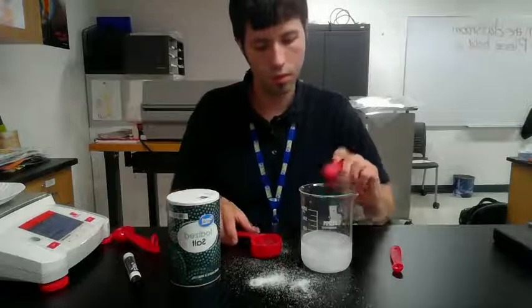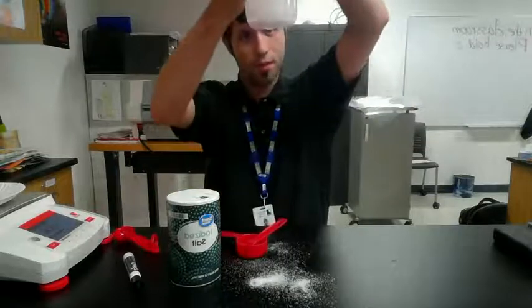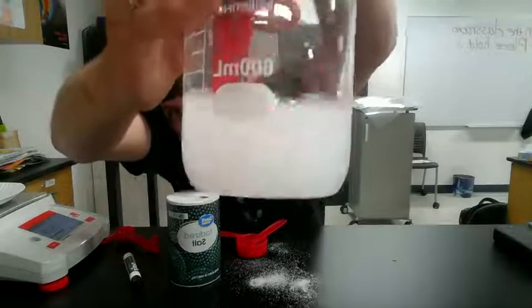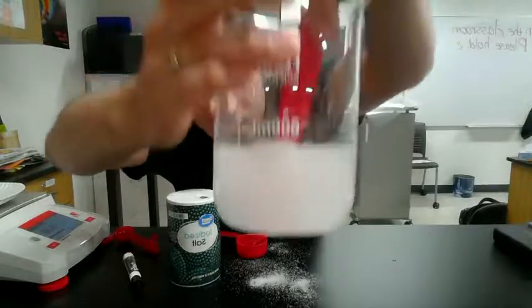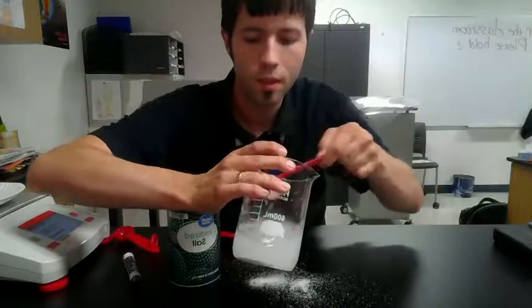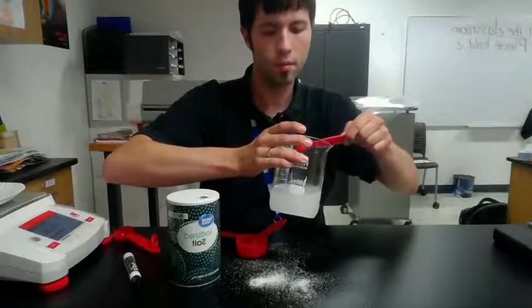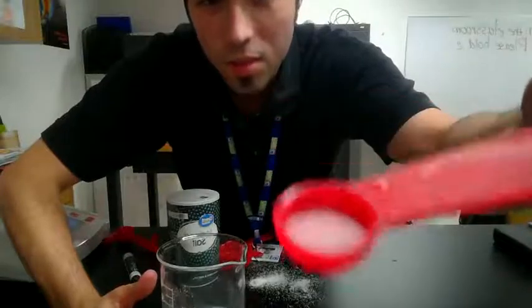3. Okay, so now I should have the maximum amount of salt dissolved in here. And actually, I'm already seeing some individual grains. I was hoping it would be a little easier to see on the camera, but you guys might not be able to see individual grains of salt with my little webcam here. So actually, I scooped some out, and you can see that there are some salt grains in there.